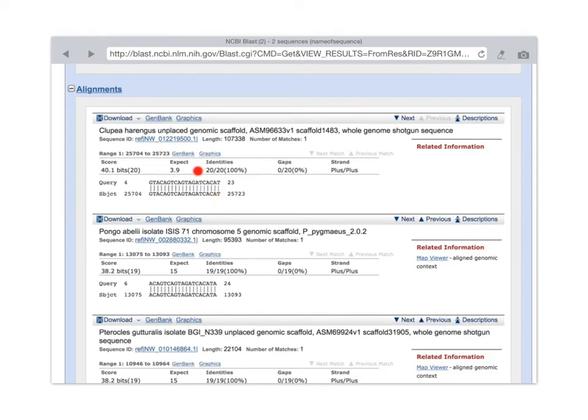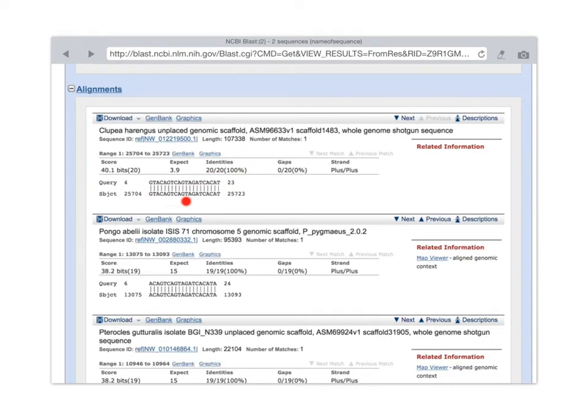And we can see that there's 100% identity. That is, every nucleotide in our sequence matches exactly nucleotides in the Clupoea herringus genome.